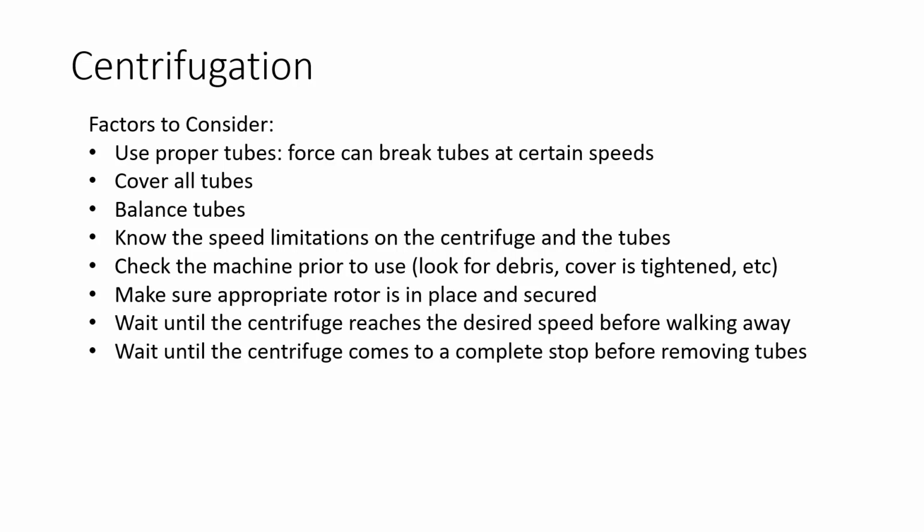Wait until the centrifuge comes to a complete stop before removing the tubes. That seems like common sense. Some of our quick centrifuge apparatuses allow you to open the cover while it's still spinning. You never want to do that. You want to make sure that it's completely stopped. More of our advanced centrifuges don't even let you open the cover until it's completely stopped spinning. So you want to make sure that you're not abruptly stopping it, because abruptly stopping a centrifuge is not only going to have some wear and tear on the centrifuge, but it's also going to cause the mixing of the specimen. So all that centrifugation that you just performed, well, now it's ruined because there was a sudden jolt or shaking of the tube.